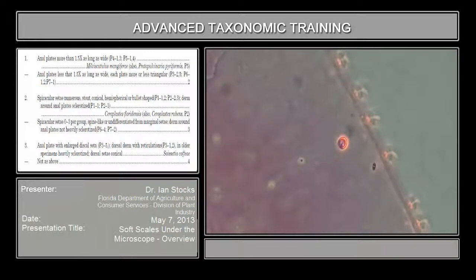The dorsum is going to be ornamented in many cases with various features. Some of them are duct-like in their function. If you go to the body margin and you progress along until you pick up on one of these, they're basically a circular bump. Okay? Let me see if I can get that out a bit more here. This is a dorsal tubercle.